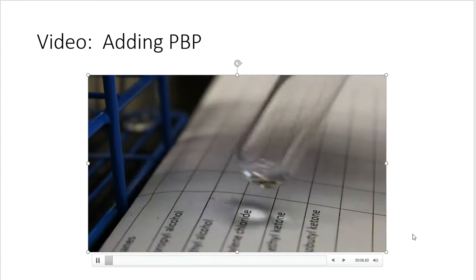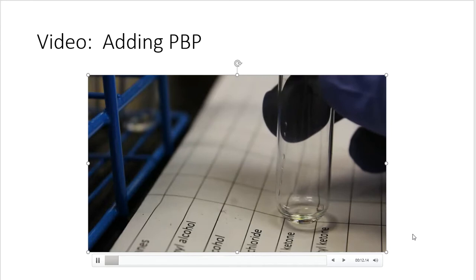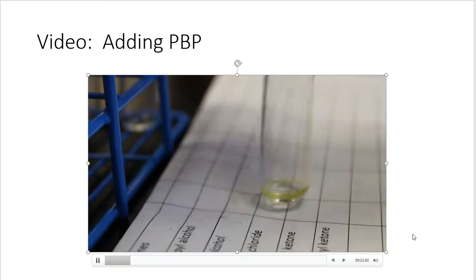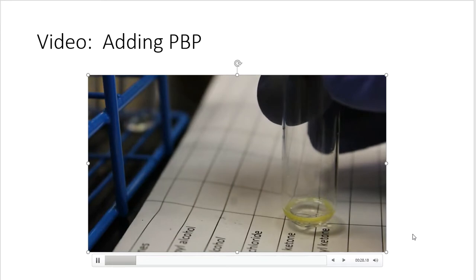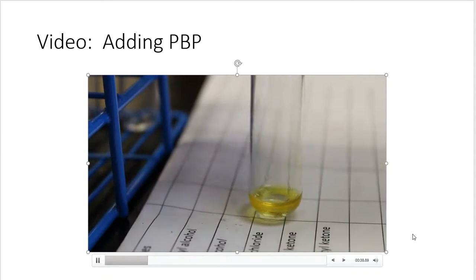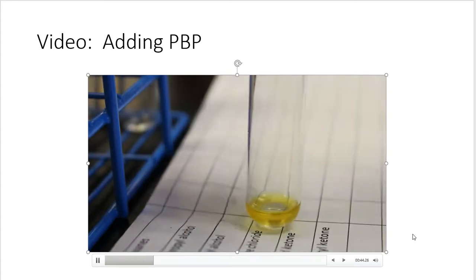Up next, we have canola oil. All right, so 2 drops are going to get added in. 1, 2. I'll give it a shake. What does it look like to you? And then I'll add 10 more, again, just to be consistent with everything else. And there we go. Again, observation based. That's what this lab is.